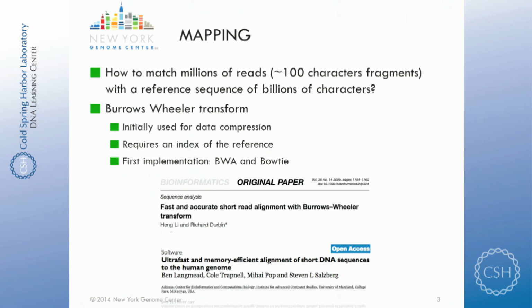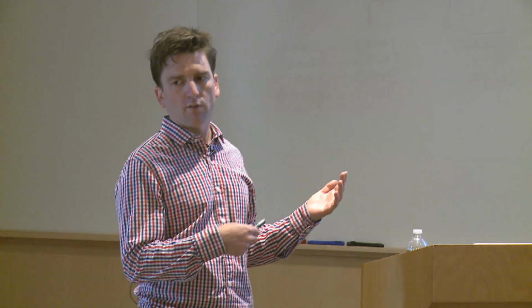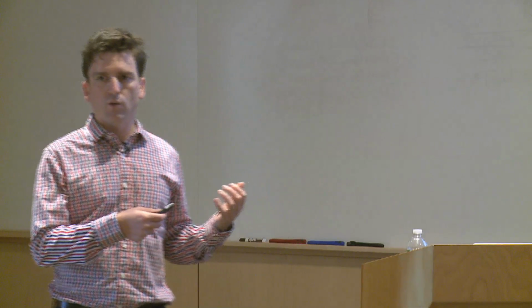Okay, so here is the mapping or the alignment. Maybe before I say that, here it applies to organisms where we have a reference genome, and that's the case for all of your problems. It's also possible to do RNA-Seq without having a reference, without knowing the genome or the transcriptome. And in that case, you won't be able to align your reads, but you'll have to assemble them into a novel transcript and then see how they relate, and possibly by mapping to a closely related species, whether they are new transcripts or duplications of transcripts or things like that.